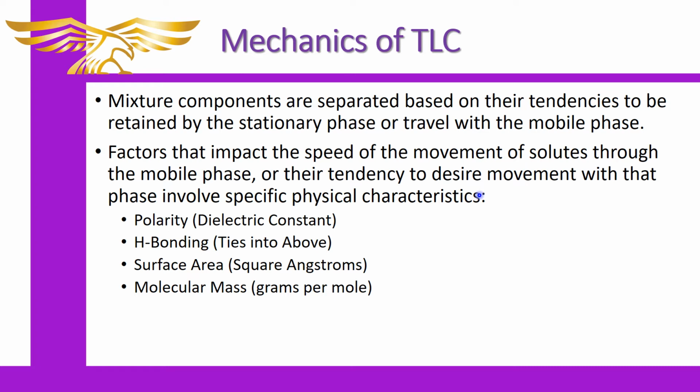I'm not saying that that does happen. I'm just giving you the idea that molecular mass is something that can become important in varying, to some extent, the movement of a molecule. And those are some examples that just pop into my mind that are kind of easy to comprehend.